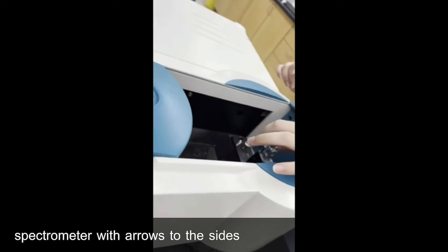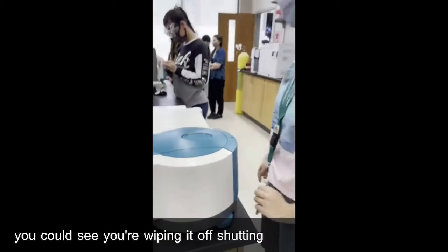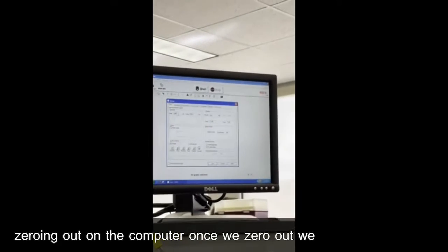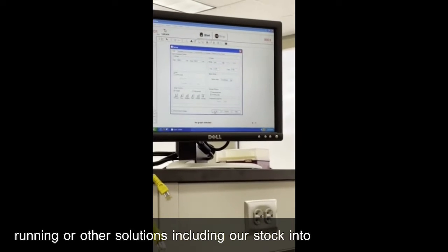Starting off with our first blank solution, we will place it in the spectrometer with arrows to the sides, also making sure it was clean. As you can see, you're wiping it off, shutting the spectrometer, and then zeroing out on the computer. Once we zero out, we can then start running our other solutions, including our stock, into the computer.